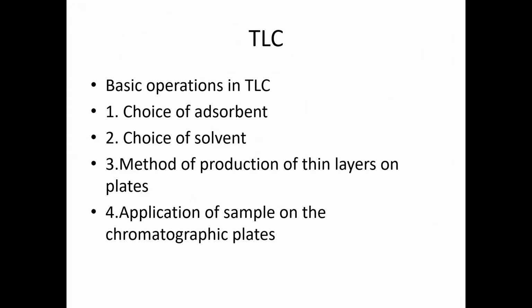The steps in the TLC technique are choice of adsorbent, choice of solvent, method of production of thin layers on the plates, and application of sample on the plates. After application of the sample, the steps are selection of the development tank, chamber saturation, and development.